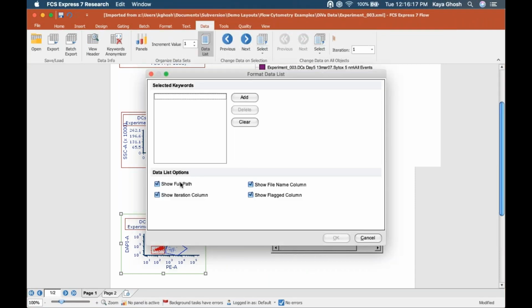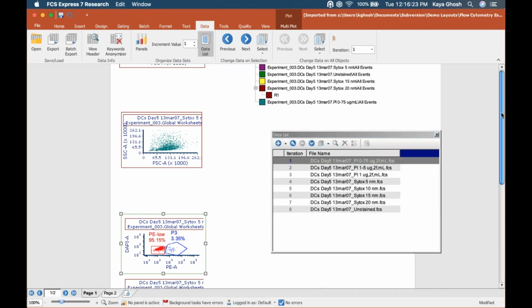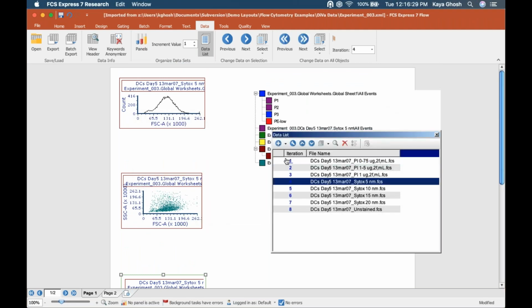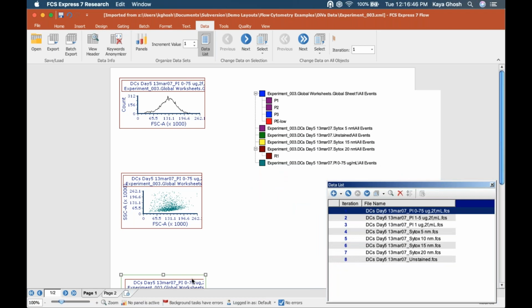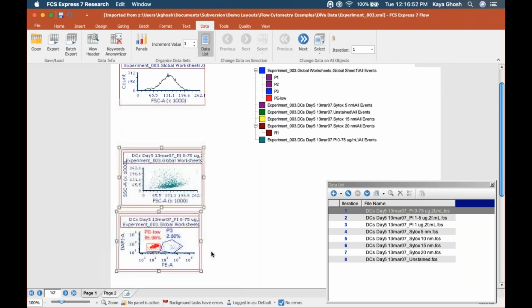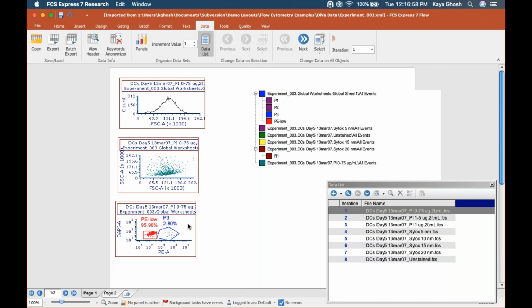And then, of course, all of our data files are here too. And I will just edit this so that you can see the file names without the whole path there. You can double click on any one of these to look at another file. And once you do that, all of these numbers should become blue. Then you can click Previous and Next, and you see we're looking at all of our data files. We're previewing them, okay? If you want to do a batch process to summarize these results in Excel and PowerPoint or PDF, you can do that. So I'm going to take you through how to do that really quickly before we go through the Accuri importer, which is going to be very fast.